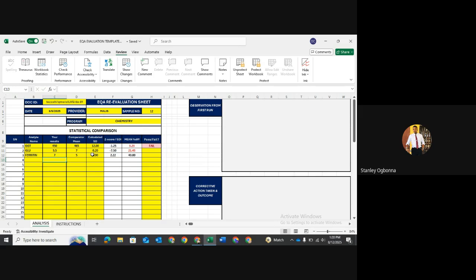Another point where check will show is when I didn't put a numerical value. Let's say I went and put positive and negative, because these things cannot be calculated. So it tells you to check, because that's an error. It's telling you to check what you've imputed. If it's okay, you do your checks.